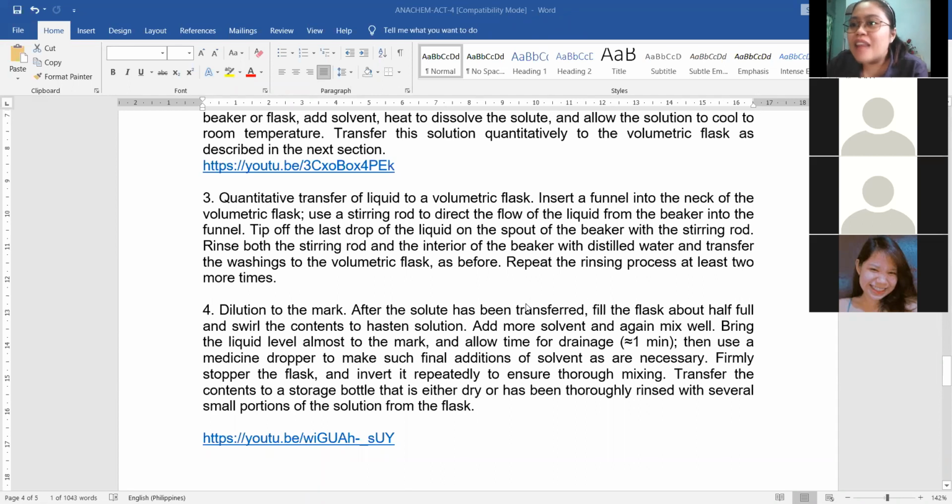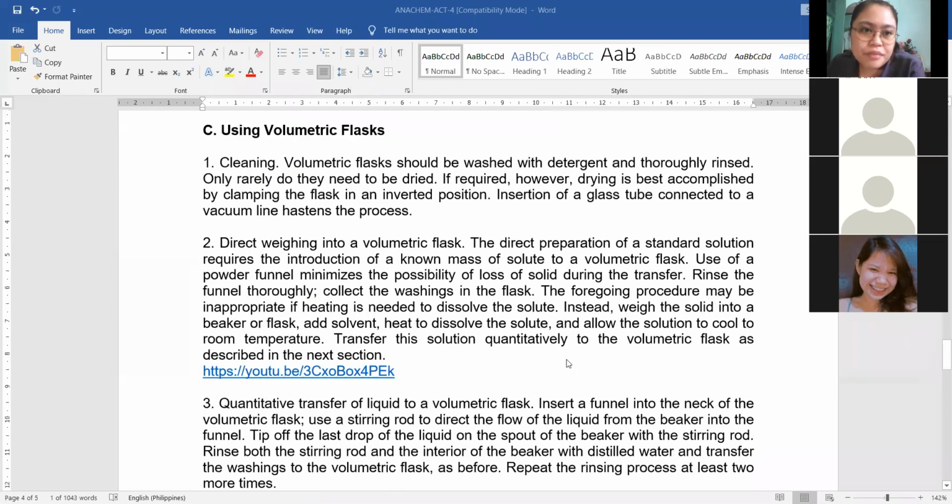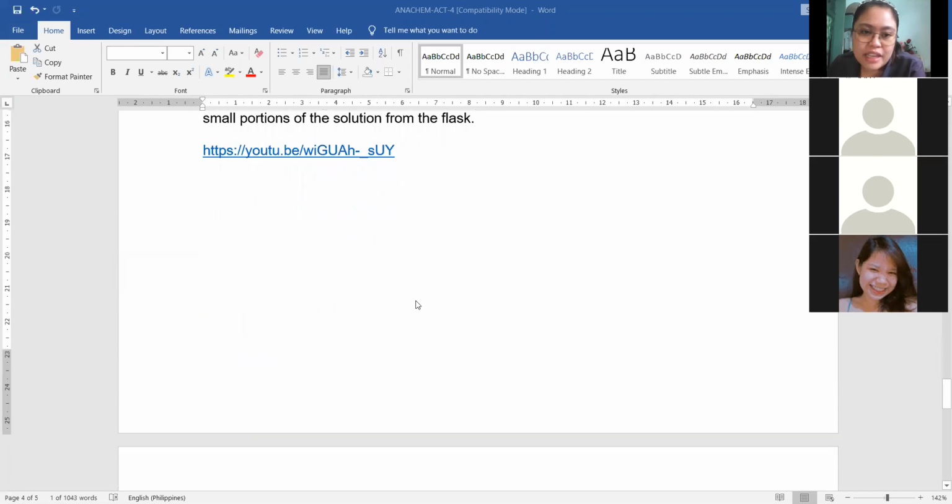Therefore, lahat-lahat na the solution plus your solvent, which is the water, kapag ma-reach mo yung graduation mark, you will have a total of 250 ml using the volumetric flask. So ito yung tatlong equipment natin sa laboratory that will give us precise and accurate measurement sa ating volume. So we have again the pipette, the burette, and the volumetric flask.